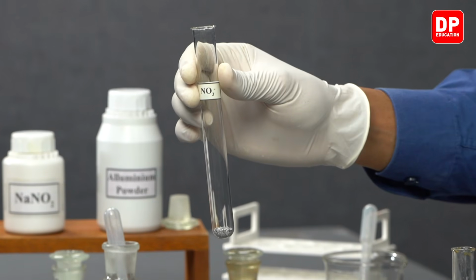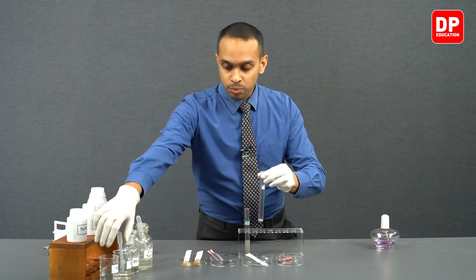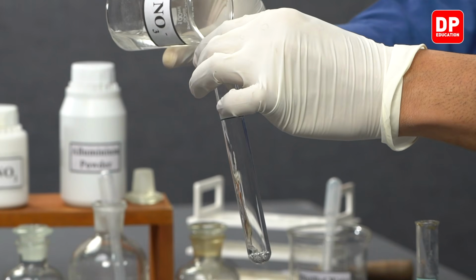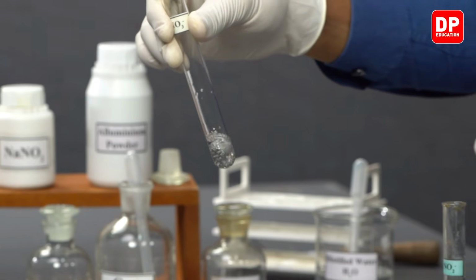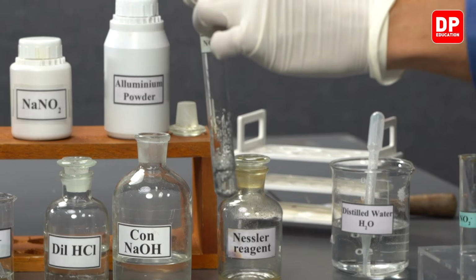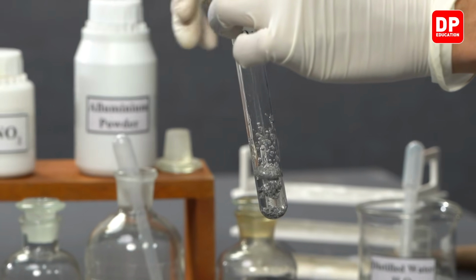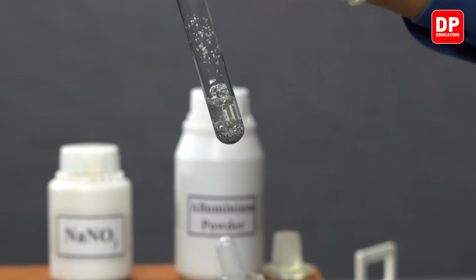nitrate ion solution reacted with aluminium. So let's take a small volume of nitrate solution, and to it we can add a small amount of concentrated sodium hydroxide. And after a while, you will observe the formation of ammonia gas.